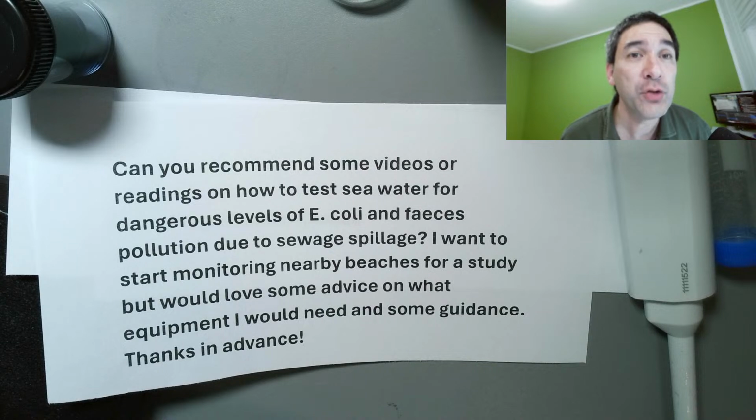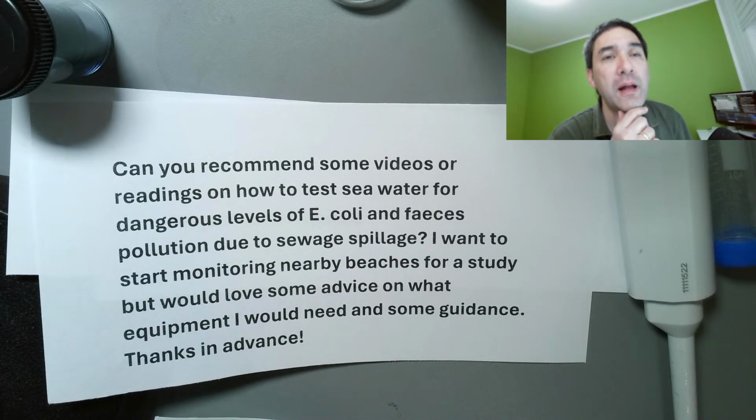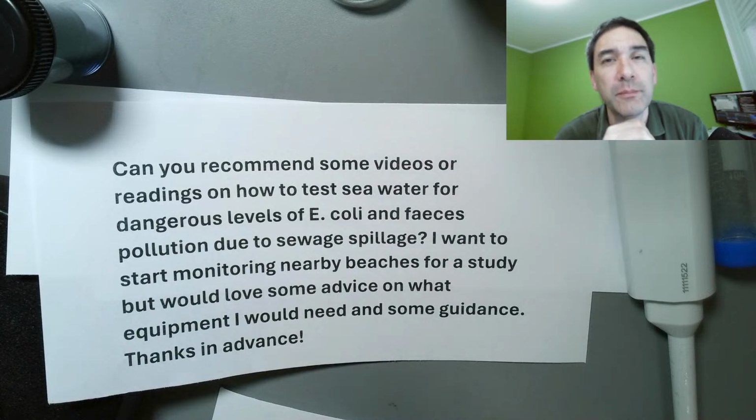So for magnification, maybe you could now and then again mention that you can easily see this or that under the 20 times or 40 times on the microscope. That way we will know what to expect. I think this is actually a good point. I was actually wondering myself a little bit, why do people always want to know the magnification? Maybe I've been overthinking this a little bit too much. It could indeed be that people want to know, am I able to see the same thing with my own microscope?